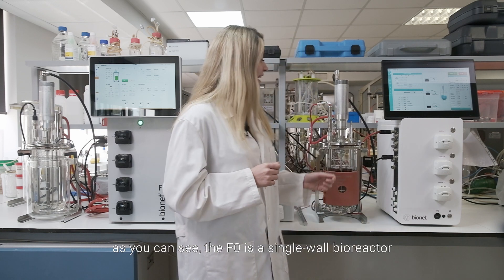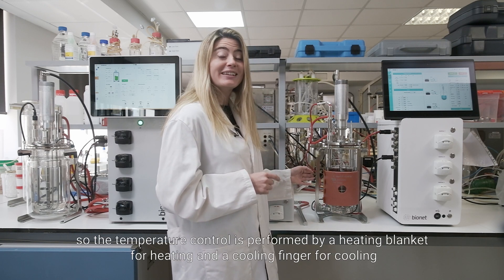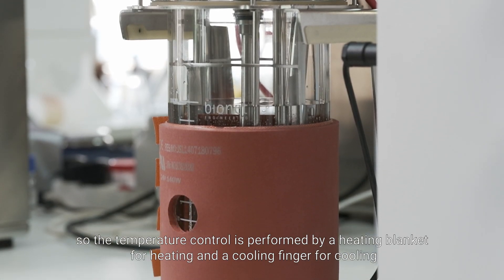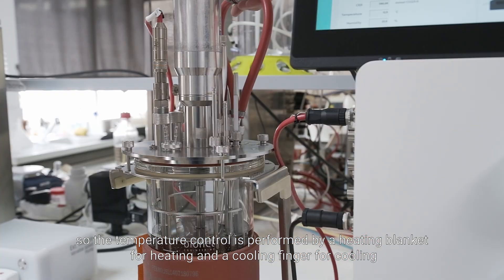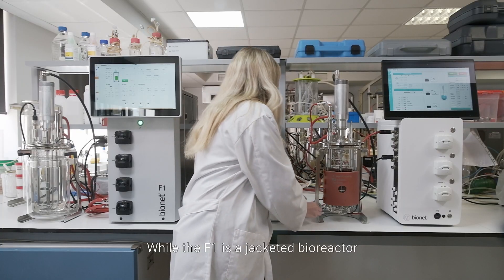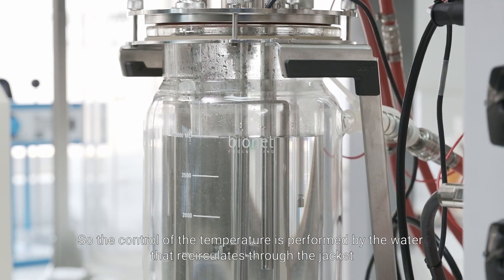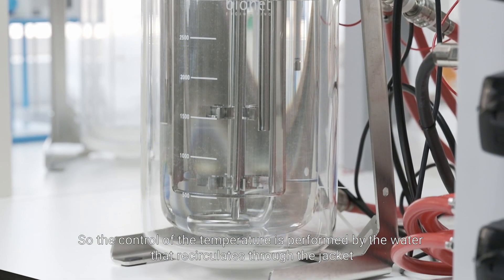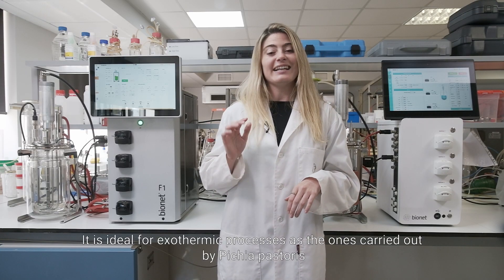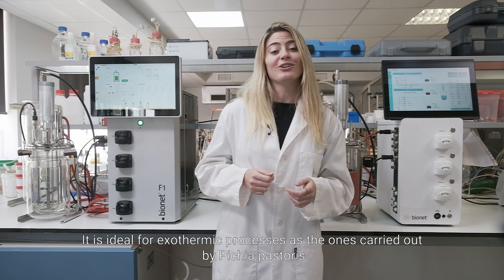As you can see, the F0 is a single-walled bioreactor, so the temperature control is performed by a heating blanket for heating and a cooling finger for cooling. While the F1 is a jacket bioreactor, so the control of the temperature is performed by the water that recirculates through the jacket. It is ideal for exothermic processes, such as the one carried out by Pichia pastoris.